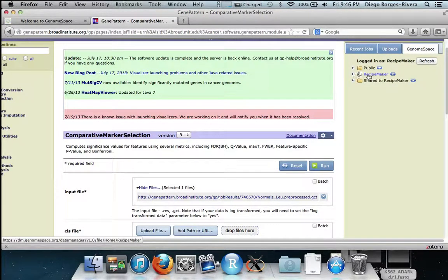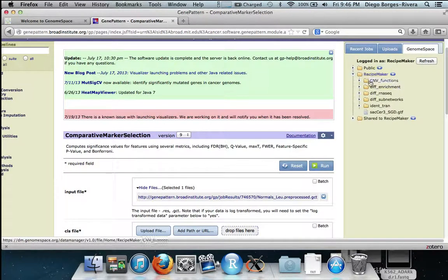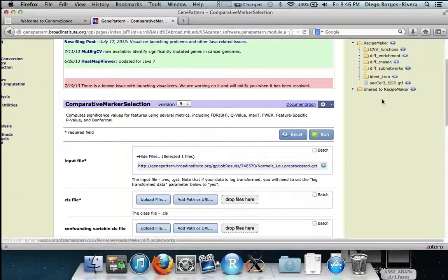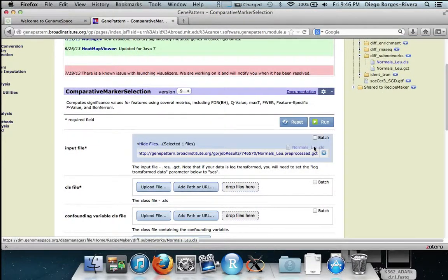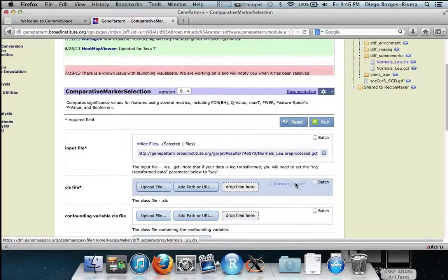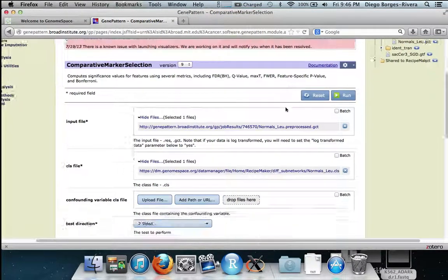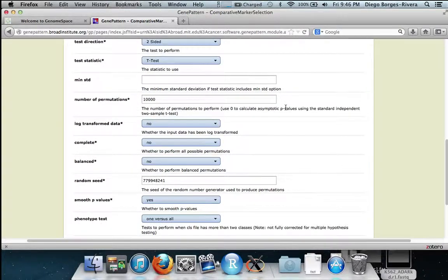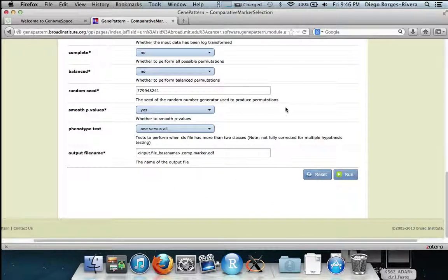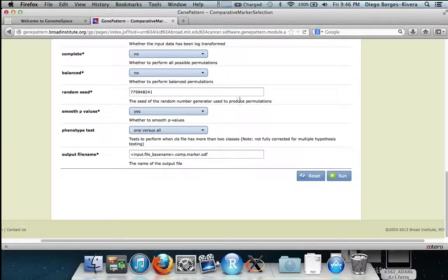We select the CLS file from our GenomeSpace tab from the subdirectory we created earlier, drag and drop to the dot CLS file. We then hit run.